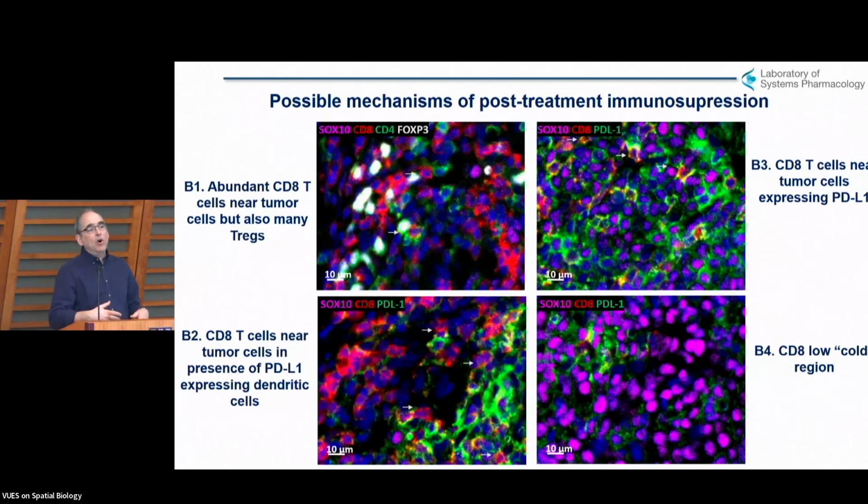The most valuable of all will be to go to intravital imaging. I don't know how many people here have encountered intravital imaging data in a mouse where you actually can watch cells in real time move around in a tissue. Those are typically 2 to 3 color images now. But if we could now fix those specimens and then subject them to the methods that we're using more broadly, we could actually draw that trajectory in time, at least inferentially.